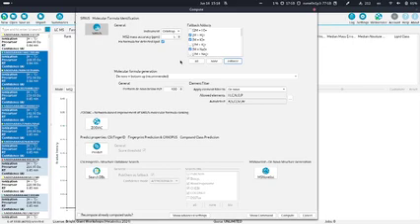In most cases, you just don't see the adduct, and you can then say, if I don't see an adduct peak, I always assume M plus H. That's, I mean, a valid strategy. Or you say, I want to not miss anything, so I choose M plus H, M plus potassium, M plus sodium. That's the default, and what I would always do, just use these three. Then it will compute molecular formulas for all three ions and rank them based on the number of explained peaks and so on in the statistical model. I would always just use these three as fallback adducts.